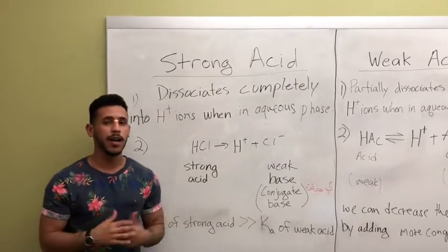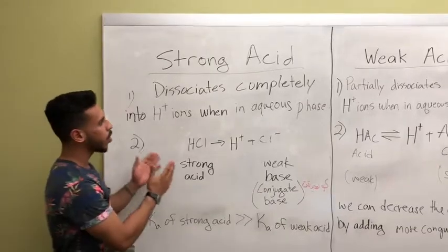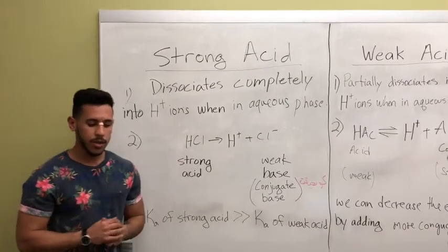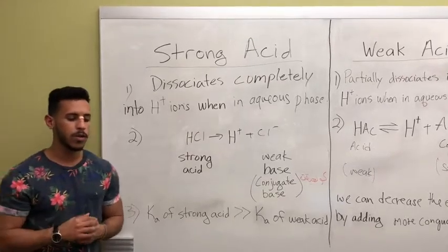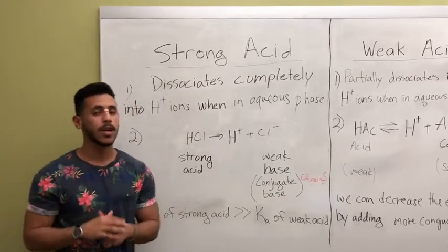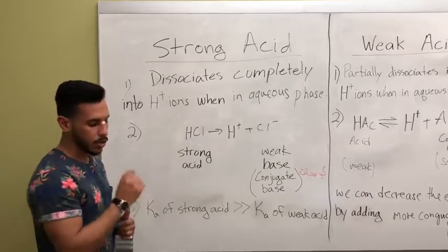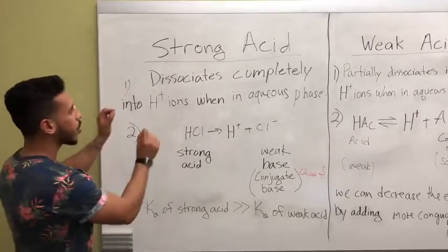Today, my group and I are going to discuss how strong and weak acids react differently in solution. Later, we will show you how to calibrate the pH meter, but first, let's talk about how strong and weak acids react in solution. First, let's talk about strong acids.